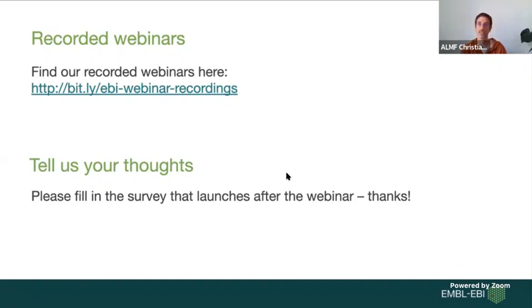Yeah, so it has a lot of things. It's just a bit harder to share because not everybody might have it. I think these days, in Python, for example, you can probably do most of it, but it's a fantastic software. It's just that it's commercial, and I wanted to restrict myself to open source freeware. But nothing wrong with MATLAB. And there's a lot of things for image analysis.